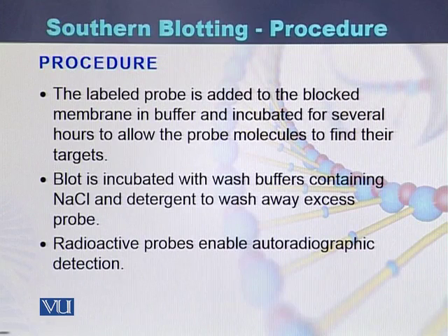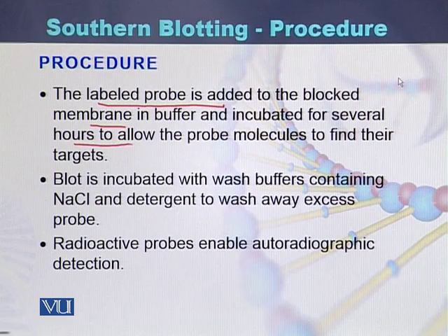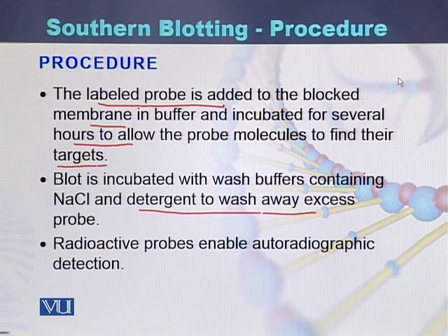When the fragments are transferred to nitrocellulose membrane, then a labeled probe is added to the blocked membrane and incubated for several hours to allow the probe molecules to find their targets on the DNA. The blot is incubated with wash buffers containing NaCl and detergent to wash away excess probe. Once the washing is performed, the radioactive probes are detected by autoradiography.